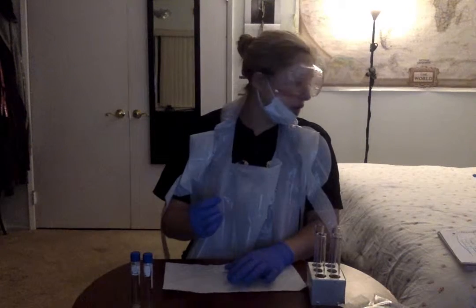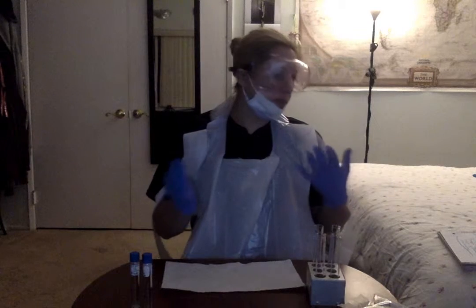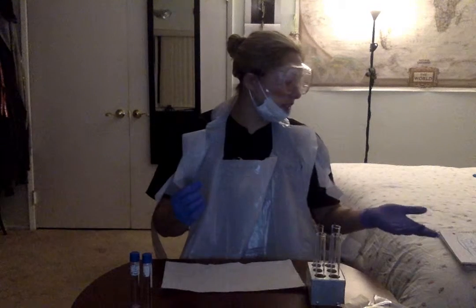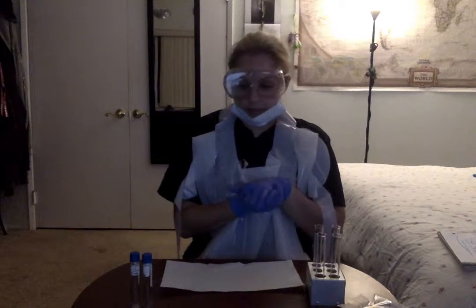The S. epidermidis actually also did bubble, but not as much as the E. coli. It bubbled for a little bit, and then it actually turned white. So, although I'm not sure if I want to say it was catalase positive, it was also, I guess, partially negative because it did include some neutralizing elements in there. So it did neutralize the hydrogen peroxide.